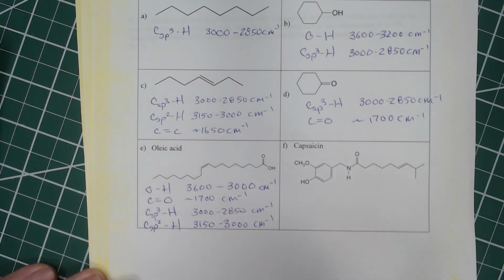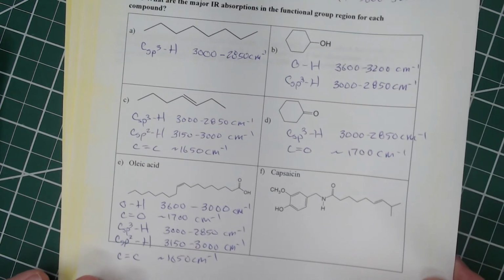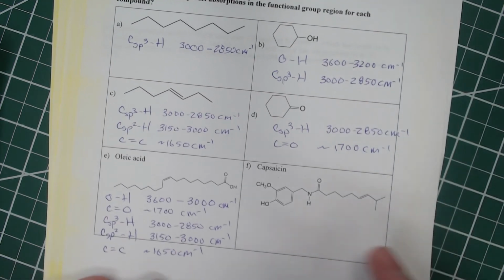So we should have peaks on both sides of 3,000 there. And then we've got one more, that carbon-carbon double bond. And it usually comes in at about 1,650, give or take.